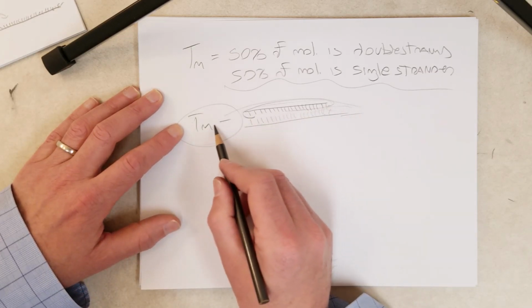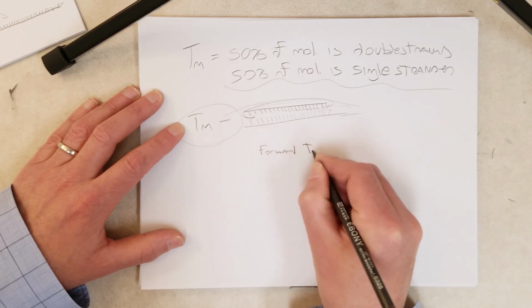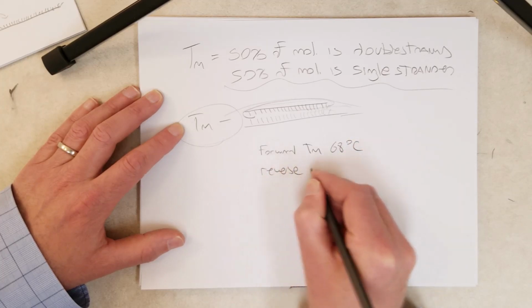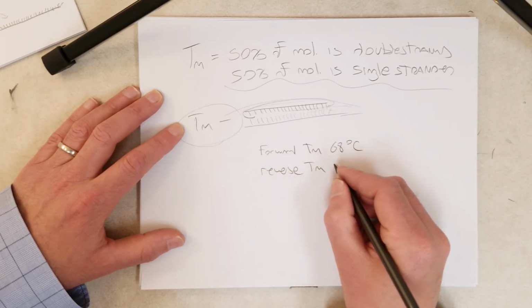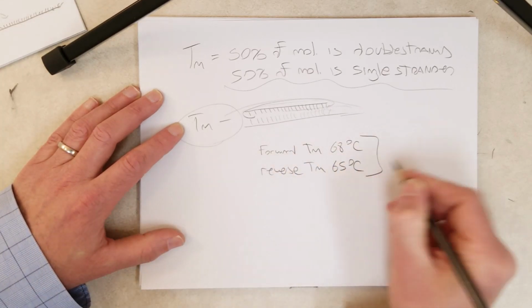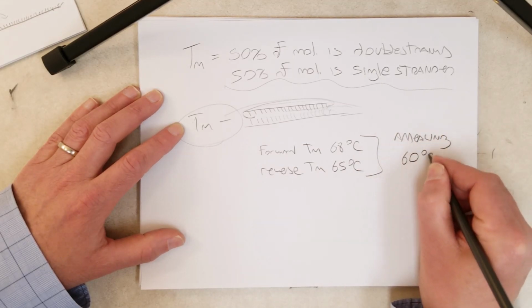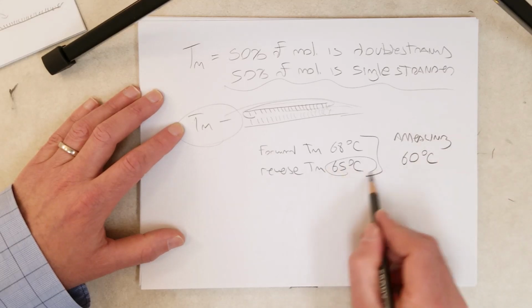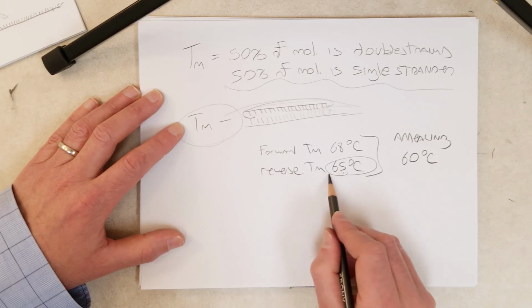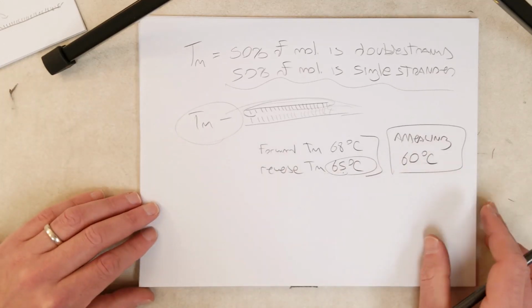Okay, so now let's assume that we have a forward primer with a TM of 68 degrees Celsius, and we have a reverse primer with a TM of 65 degrees Celsius. And so the annealing temperature you would choose for this PCR reaction should be 60 degrees Celsius because it's 5 degrees below the TM of the primer with the lowest melting temperature. So that's how one would choose the annealing temperature.